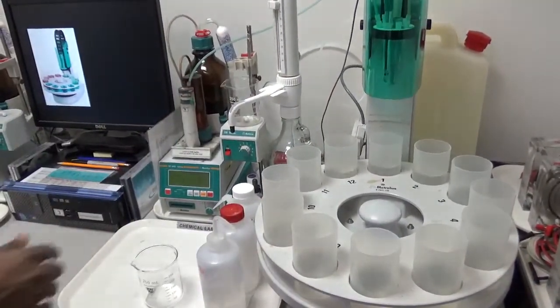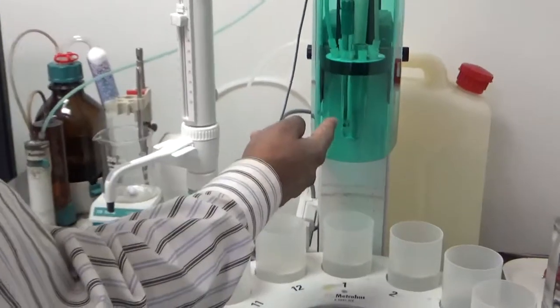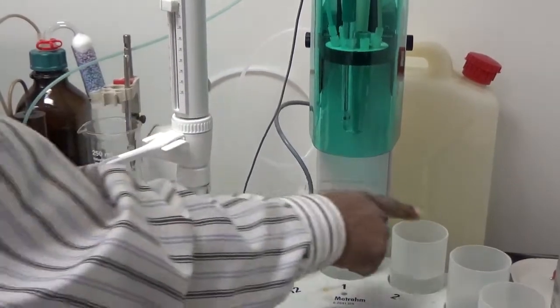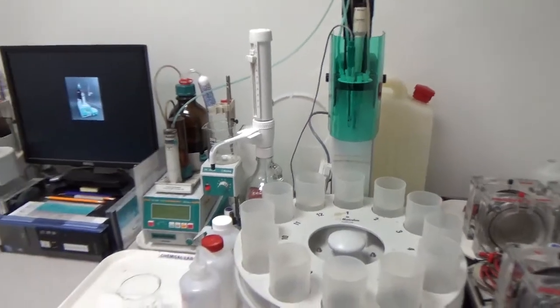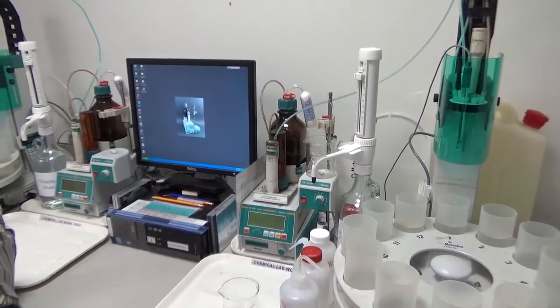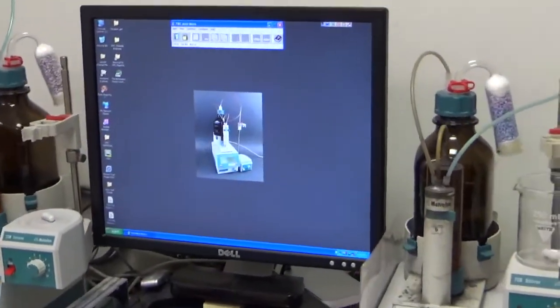When titration starts, the electrode and buret go to station 1, titration is performed, then it goes up to station 12 to clean, then to station 2, and so on. To do the titration we use the Brinkmann Titrino Workshell software from Metrohm. In the software, the user manager shows all connected units — 751 A, 751 B, 730 connected to 751 A, and 730 connected to 751 B — all four units controlled simultaneously.